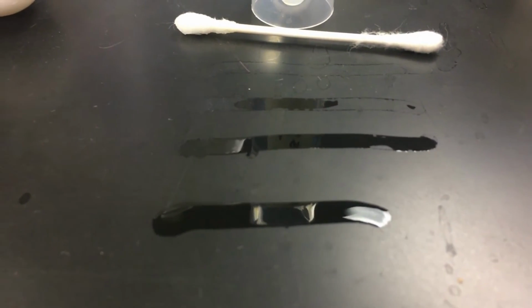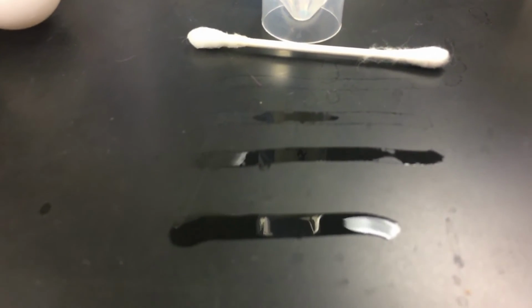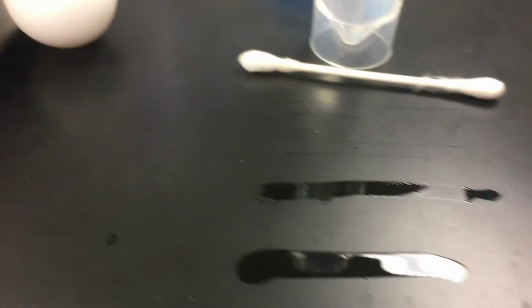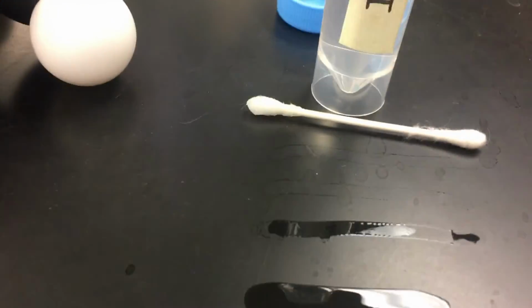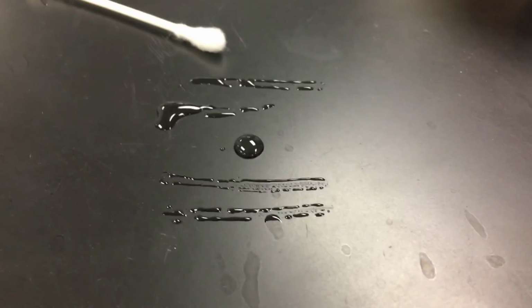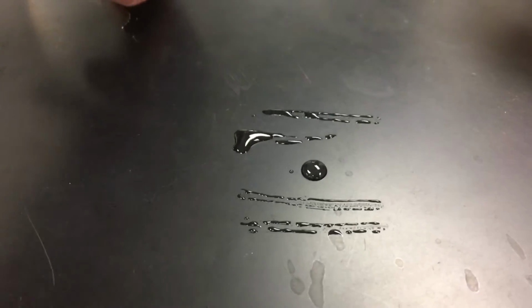Again, very little surface tension, not as strong of a cohesive intermolecular force between these molecules compared to what's going on here. Again, our rubbing alcohol molecules are escaping from the liquid phase into the gas, while our glycerol is still just sitting there. Just to cut to the chase, this glycerol is not going anywhere. I can leave this here for days and days and it will not evaporate. I have to clean it up with soap and water.